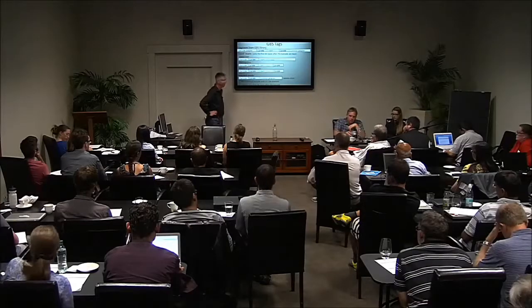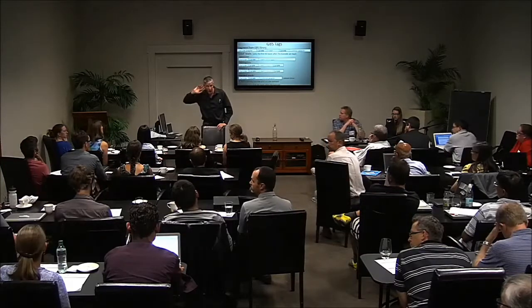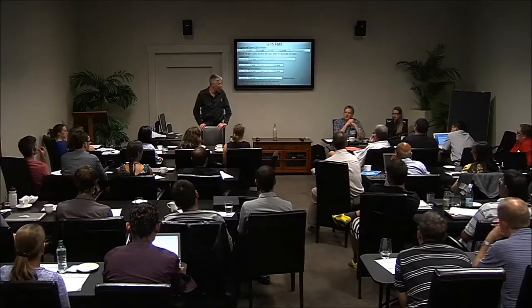Sorry, can I just ask another question? How short is too short? Because you're keeping ones that are less than 64, right? Yep. So how short is too short? It depends on the species. When they get really short, they become really repetitive, so then they're not really useful for calling SNPs.